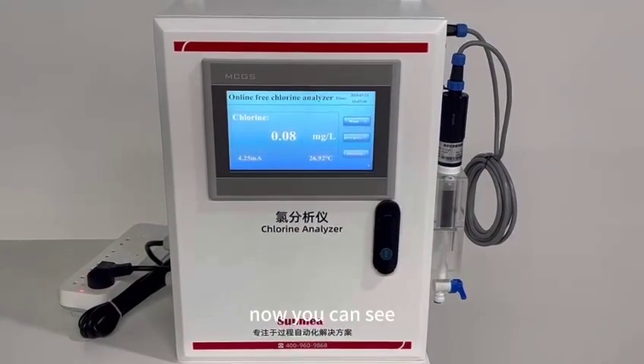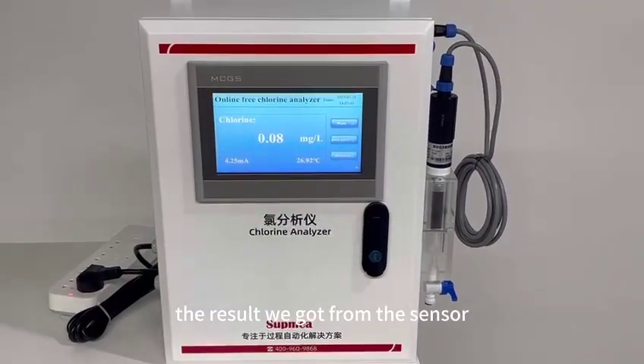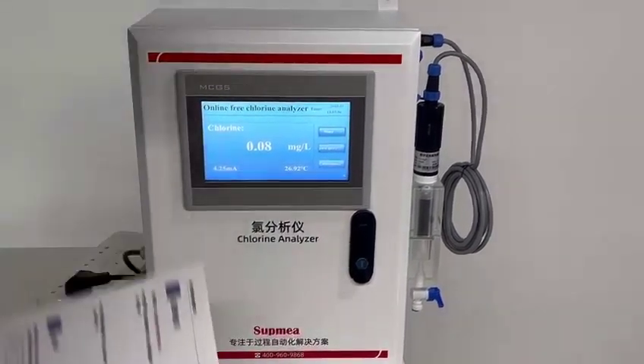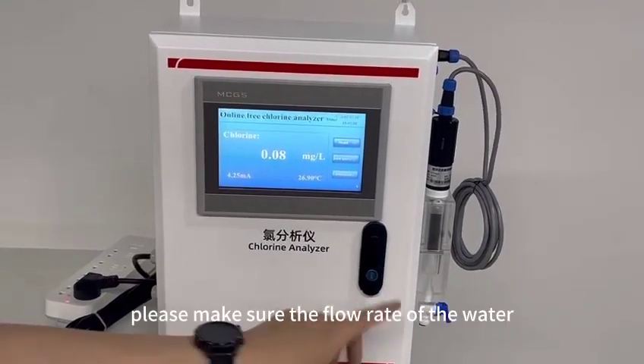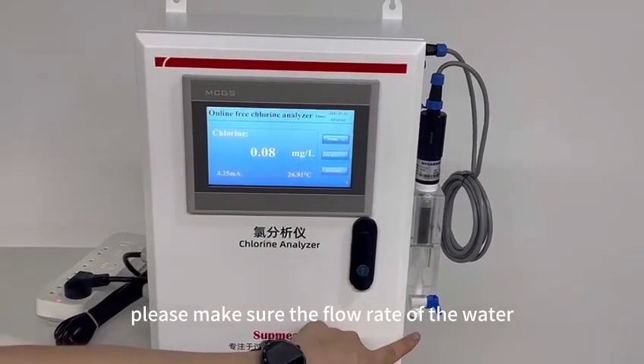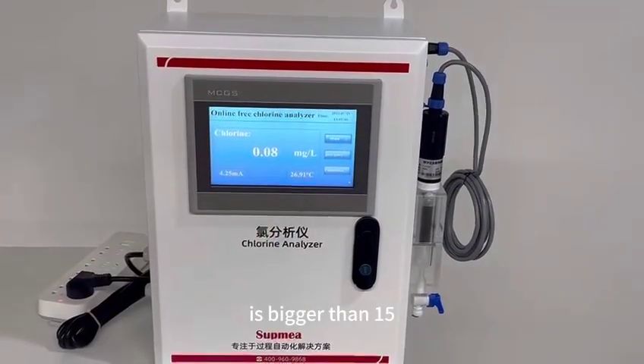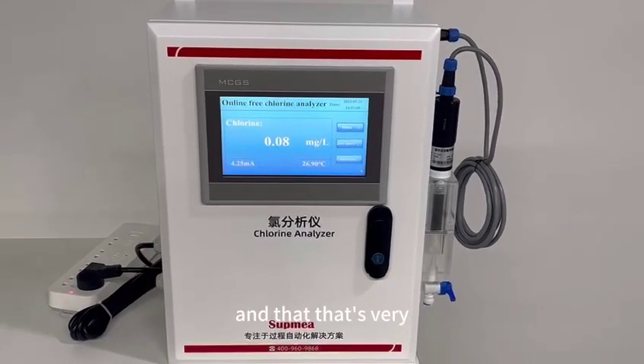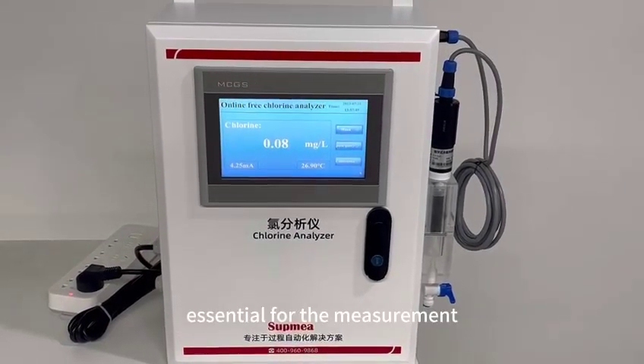Now you can see the result we got from the sensors. Tip one: please make sure the flow rate of the water is bigger than 15 liters per hour — that is very essential for accurate measurement.